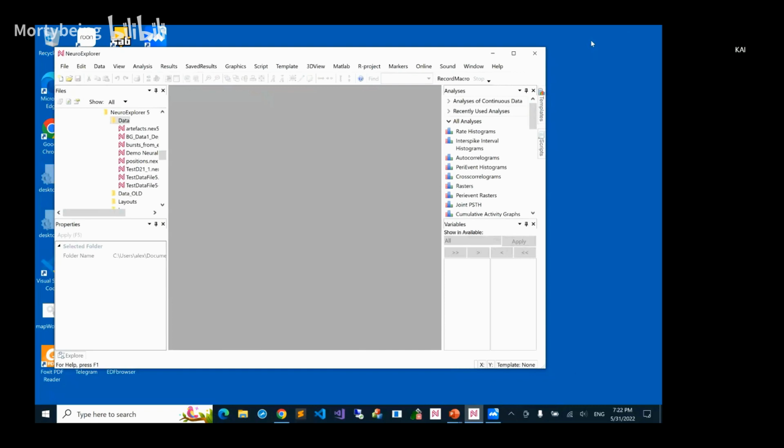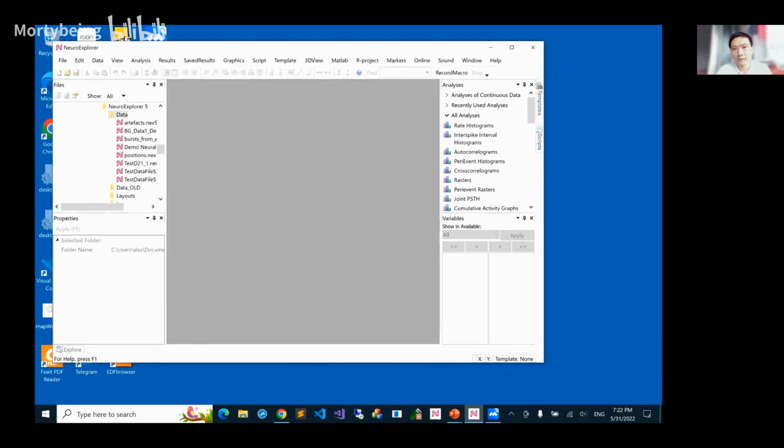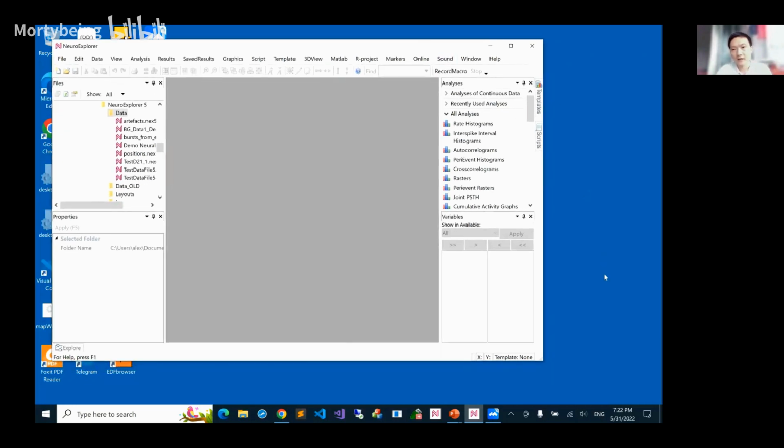You're welcome. Yes. Alex, actually, what Kai mentioned, the NeuroOmega is based on our older products. It's called SNR. It's the format, it's the same. But I think there needs to be some SDK to connect to NeuroExplorer. I'm not sure. We are now working on FRS to make NeuroExplorer built-in, and that can do online analysis. That is based on some SDK, or some other technology to make it.